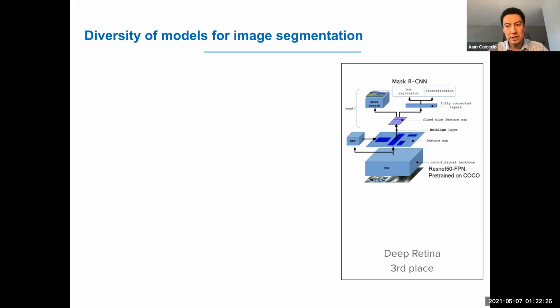It's kind of good to see that, reusing computer vision techniques properly, you can achieve high accuracy for cell segmentation as well. Many other teams used this same architecture, but they were not able to make it work as accurately as this specific team. So that also tells us that it's not just about the architecture, it's also about the way and the rigor in which you run cross-validation experiments to make sure that the algorithm is working properly.